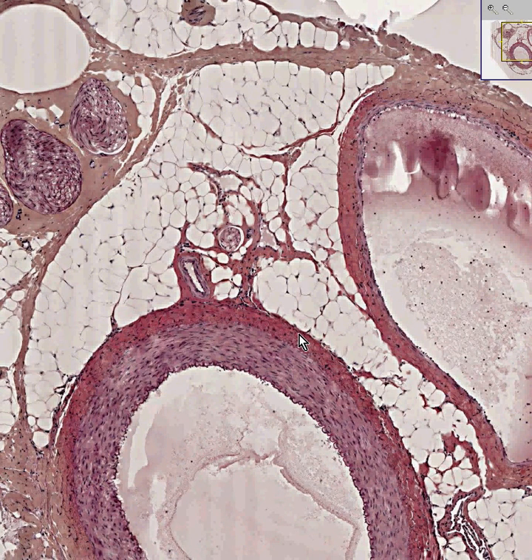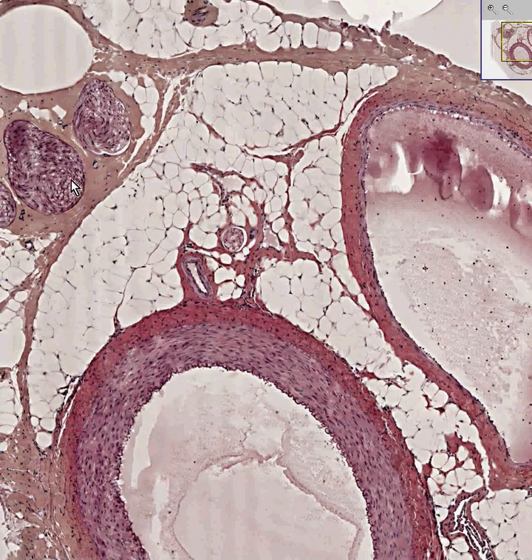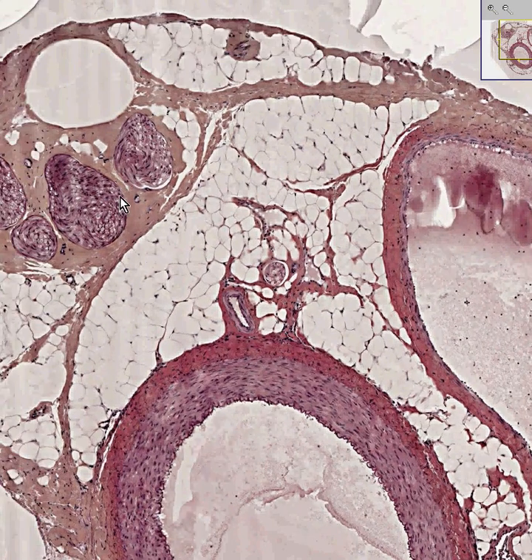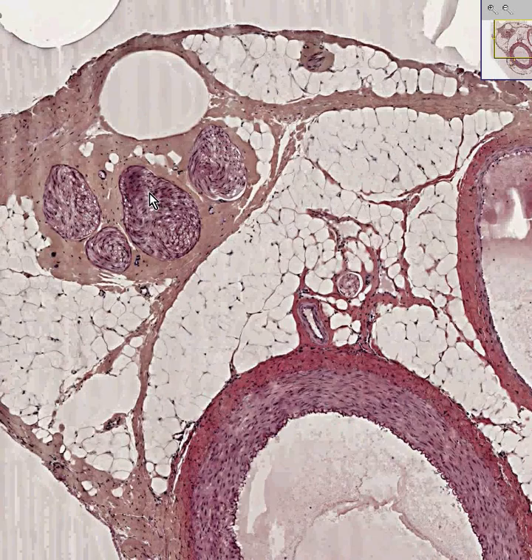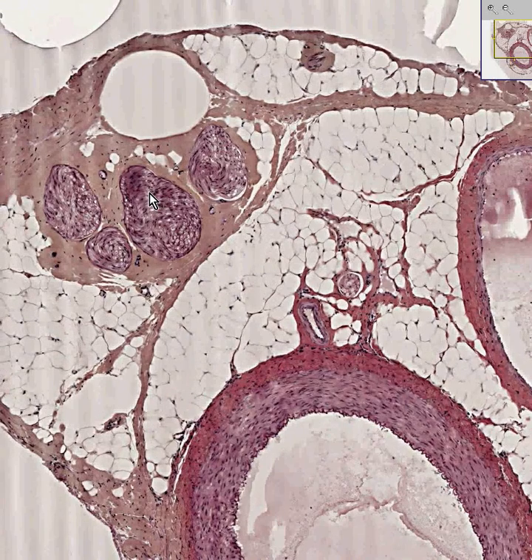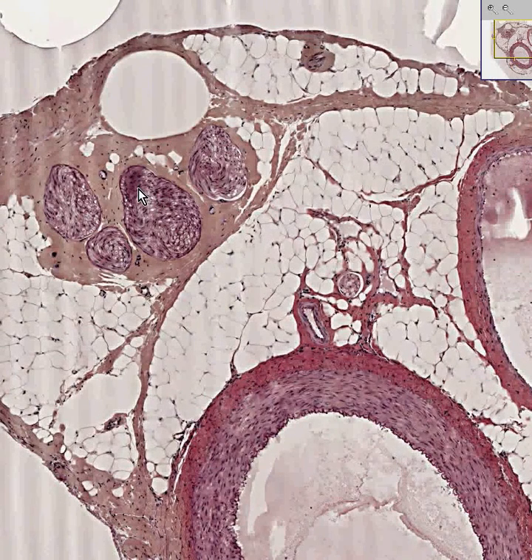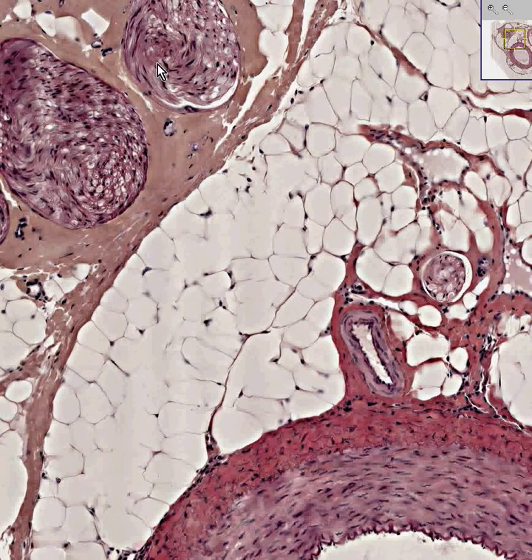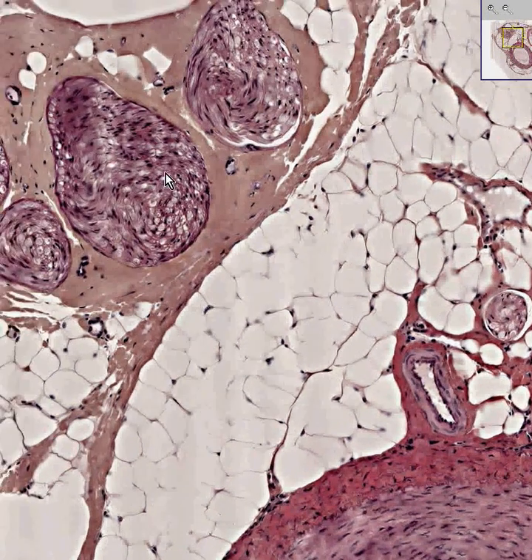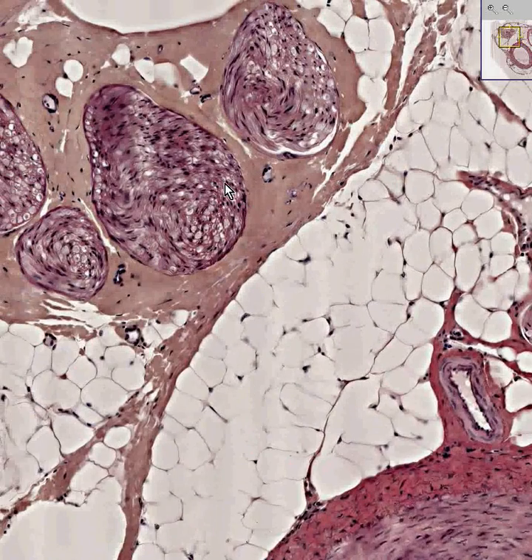And last but not least, here is your nerve. I don't know the name of it, but if you told me what muscle this was going to, I could give it a good guess. Like any other nerve in the body, it'll consist of these little spindly, squiggly, feathery cells known as Schwann cells.